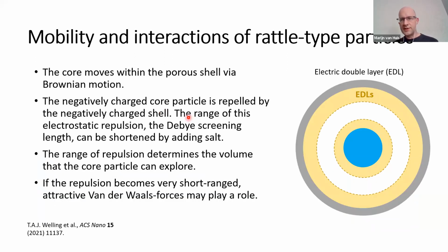Now, the first thing that we have to do is to track how we can really manipulate these particles. And the special thing here is that we're moving down to the nanoscale. So these things are known for the microscale, but they have never been studied at the nanoscale. And it gives you really the opportunity to study interparticle potentials also at the nanoscale. And that has never been done before. At the nanoscale, things really change. So this is a new field that we are entering.